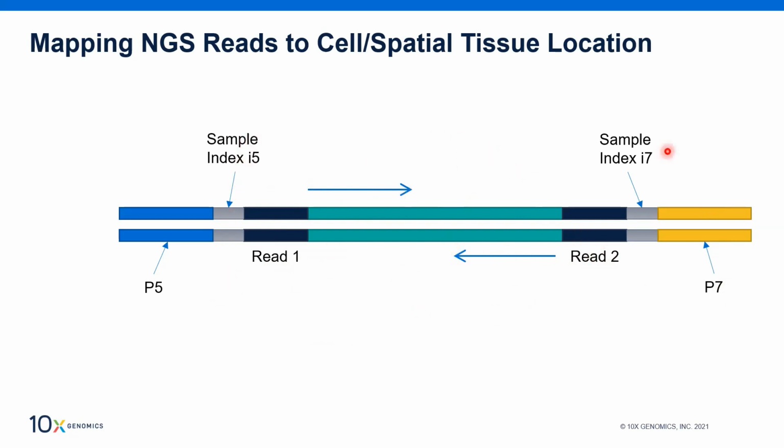Then we have the I5 and I7 indexes. These indexes are useful when you want to run multiple samples in one go, since the index reads help you demultiplex the data. Apart from this, you can also see the P5 and P7 primer adapters. These are an inherent part of the Illumina sequencer; they help the DNA elements bind to the flow cell and perform the clonal amplification, which Udit has just shown in the video.